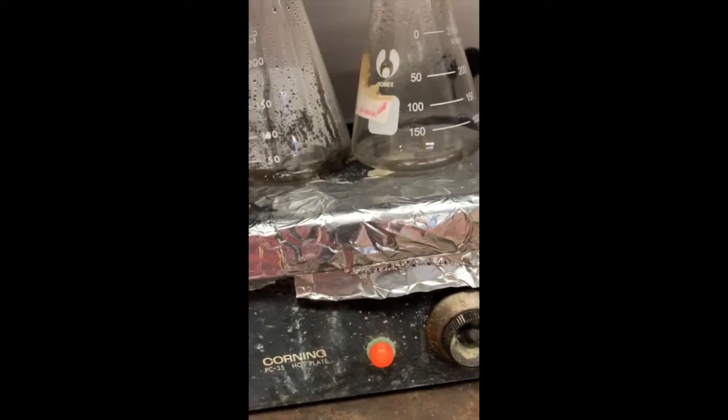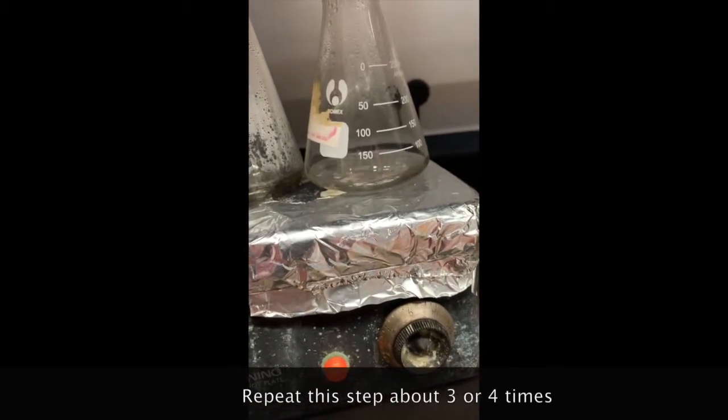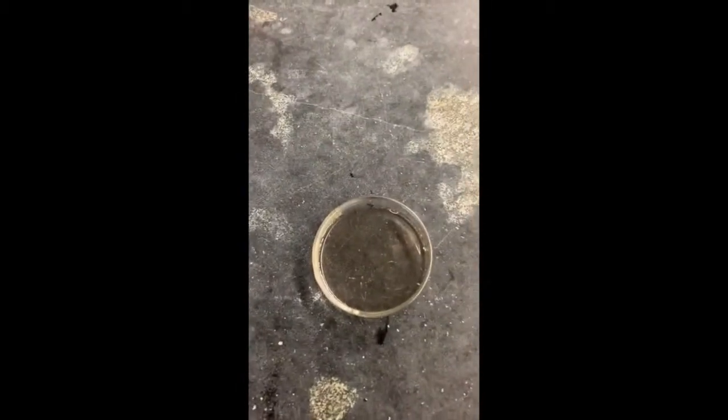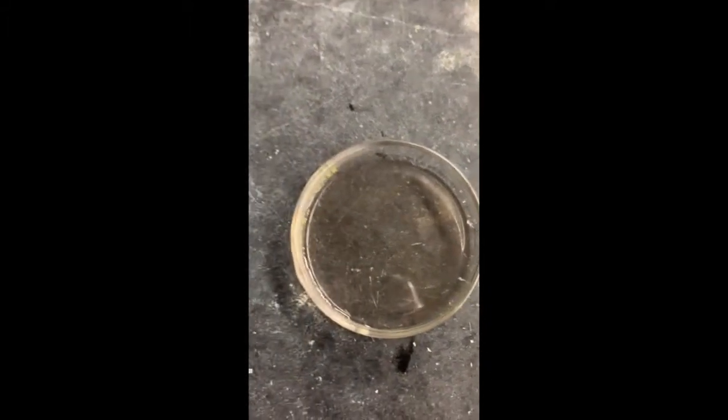Then we're going to add a little bit of water to it after letting it boil off for a while. We're going to do that a few times and see if we can get a crystal to produce. So we took this off the burner and added a little bit more water to it. I didn't do it exactly right, but if I let it sit out overnight, it should crystallize and we should have the final product.